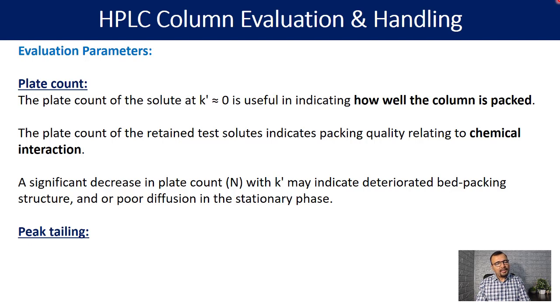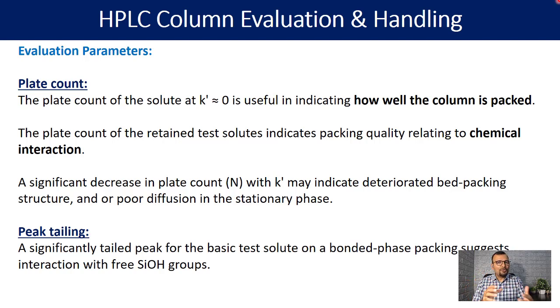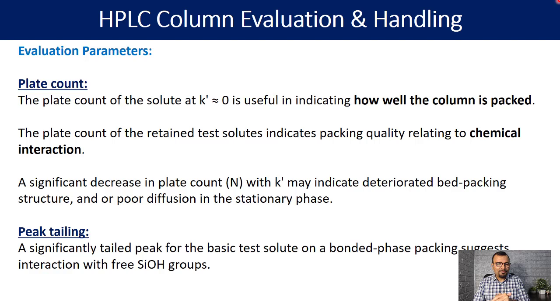Peak tailing is also one of the very important parameters. A significantly tailed peak for the basic test solute on a bonded phase packing suggests interaction with free silanol groups. This is a secondary interaction that generally takes place between deprotonated silanol and protonated basic compound. This interaction is not preferred because it always brings tailing to the peak. If the silanol effect is increasing, that will be reflected in increased tailing for the basic compound. Peak tailing therefore needs to be evaluated during column performance testing.